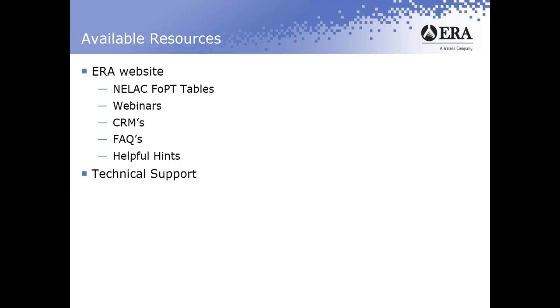Okay, so some available resources. On ERA's website, we have links to the latest NELAC FoPT tables. If you want to take a look at those and see how the actual criteria is described and the acceptance criteria.